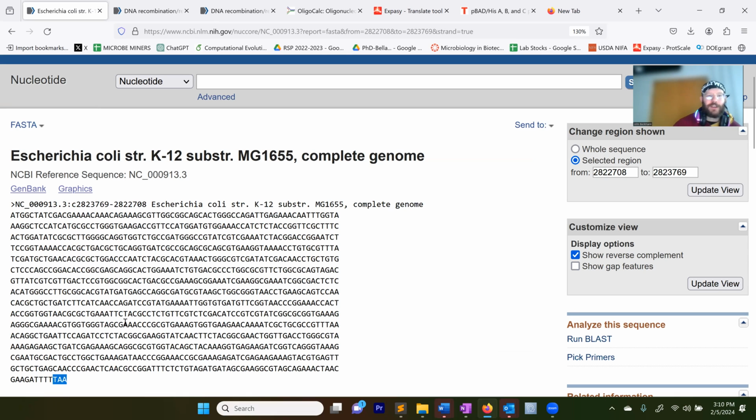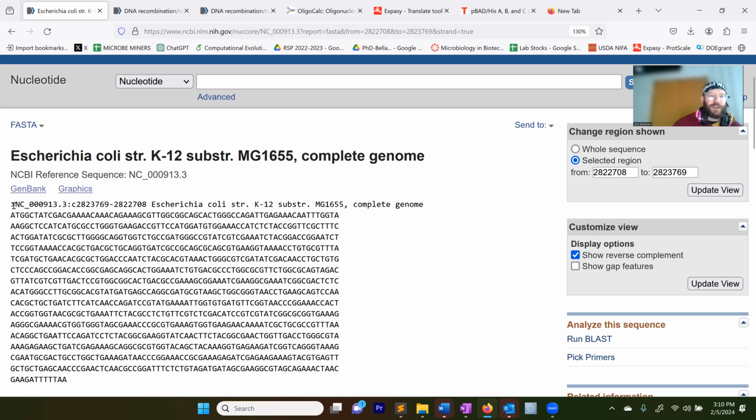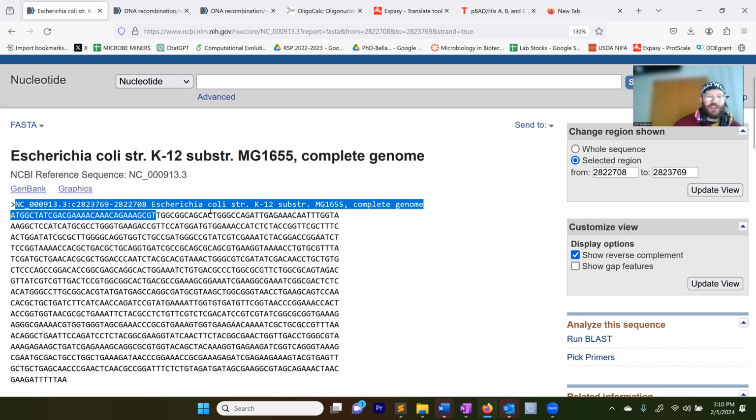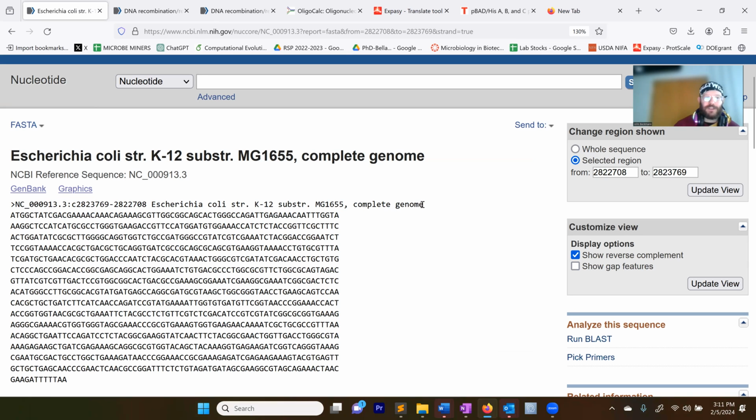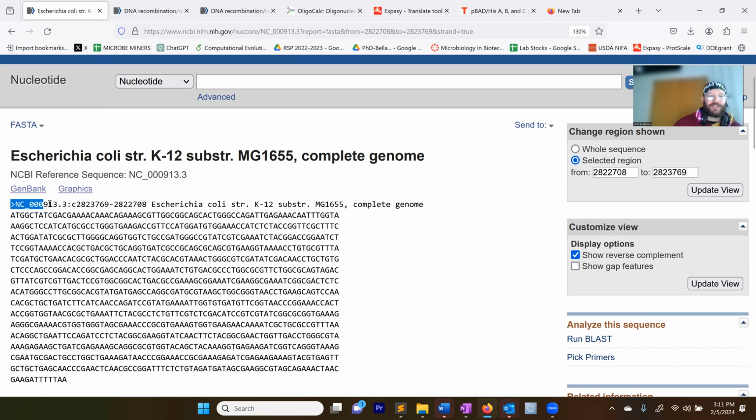Another thing is this very common format where you have this little caret and then a bunch of information and names and then a carriage return, which is a return to the next line. This defines an actual computer format called FASTA format. FASTA format is the syntax for how you describe strings of genes, either in protein or DNA sequence.